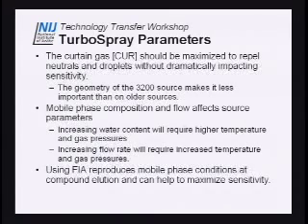Increasing the flow rate will also require an increased temperature and gas pressure. Remember, if you start increasing the flow rate too much, the first thing that's going to happen is the droplets are going to get bigger because there's more fluid coming out of the end and it's breaking off sooner. So you get bigger droplets, which means you've got to increase the temperature so that you can shrink them down. And it's only by shrinking them down that the ions get crowded together on the surface and they have enough energy to just go boink into the gas phase. And that's what you're really trying to get after for electrospray.